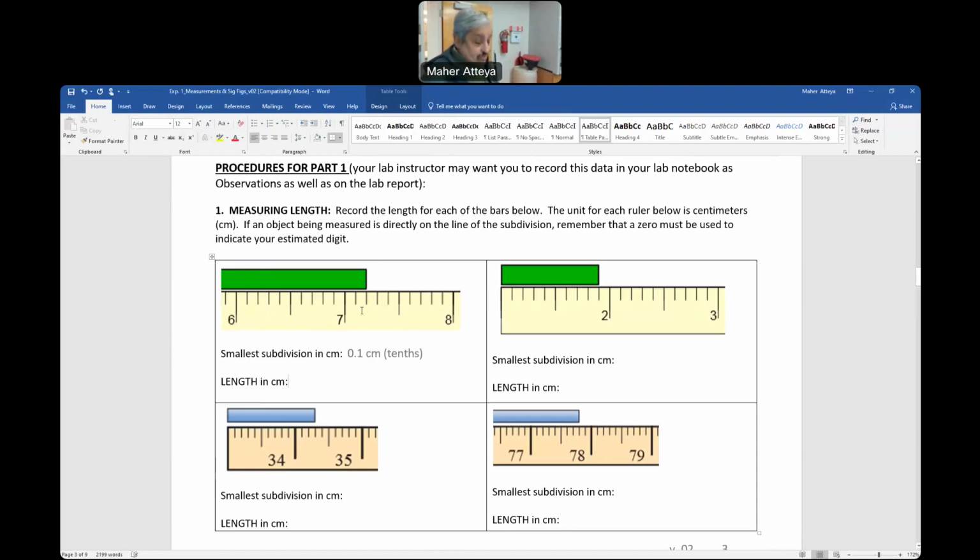Remember the ruler here, as you see, this is the small one, the upper one. Each centimeter is divided in 10. Correct? So what's the value here going to be? Somebody help me here. This is for me 7 point what? 7.2. Okay, I'll take this one.